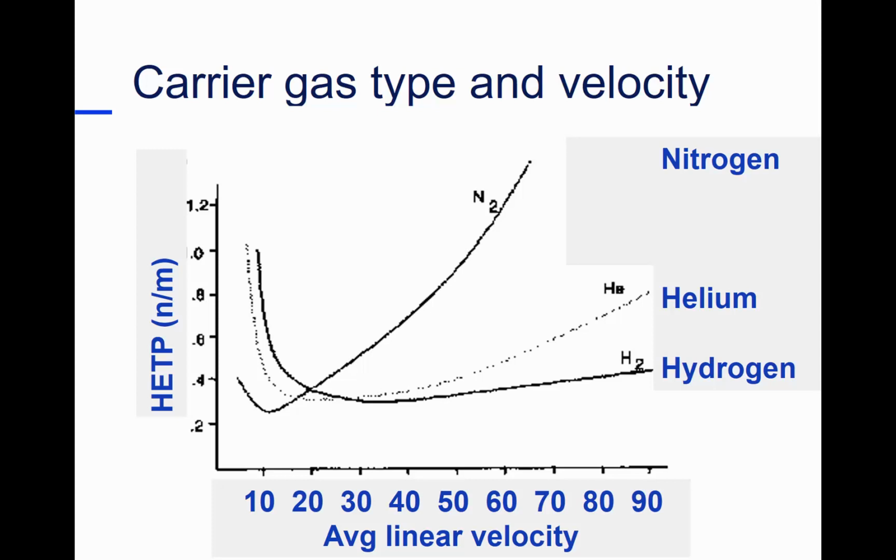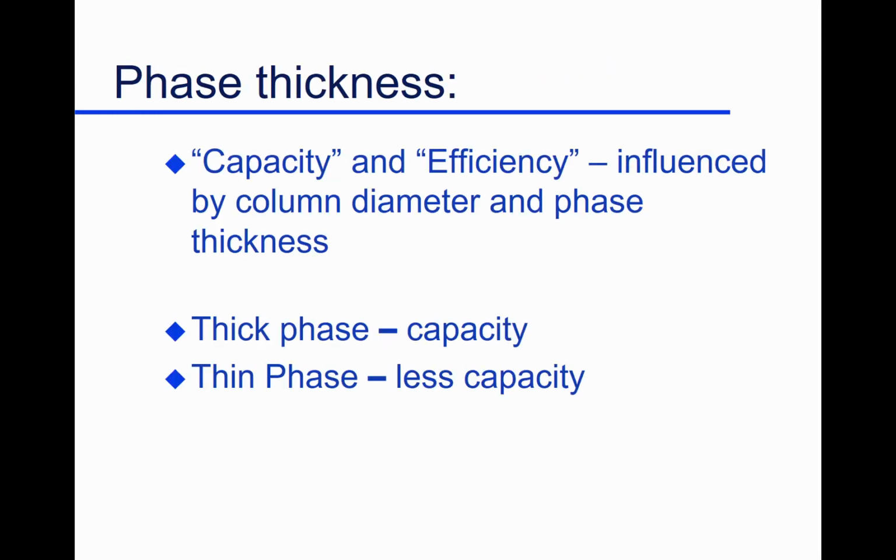But it saves us a good deal of time. If it saves us time, it saves us money. And so if you go down to our laboratory, that's really all we run. That's the only carrier gas we run. It's cheap. It's cheaper than helium. It's cleaner than helium in terms of contaminants. And it saves us time.